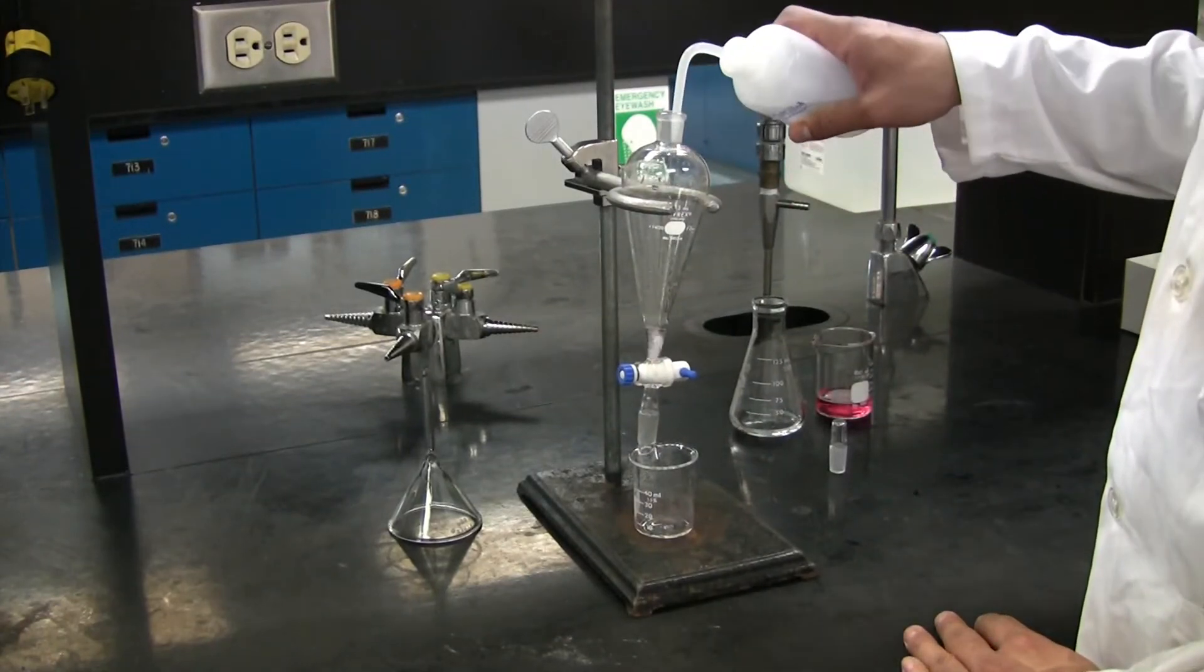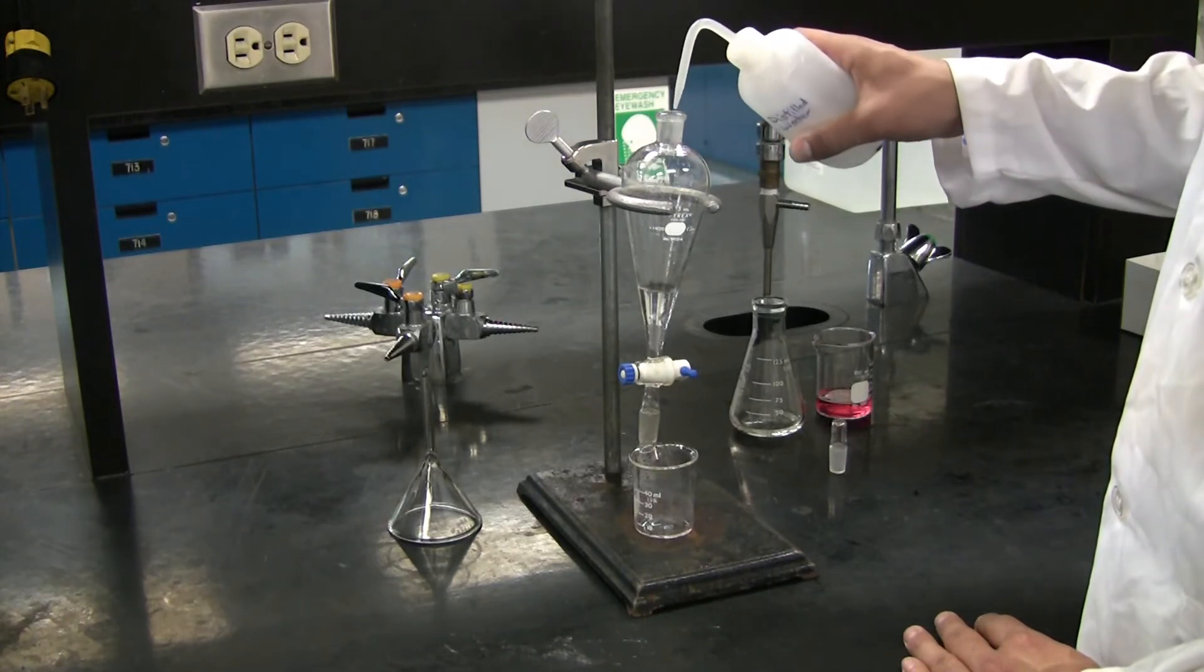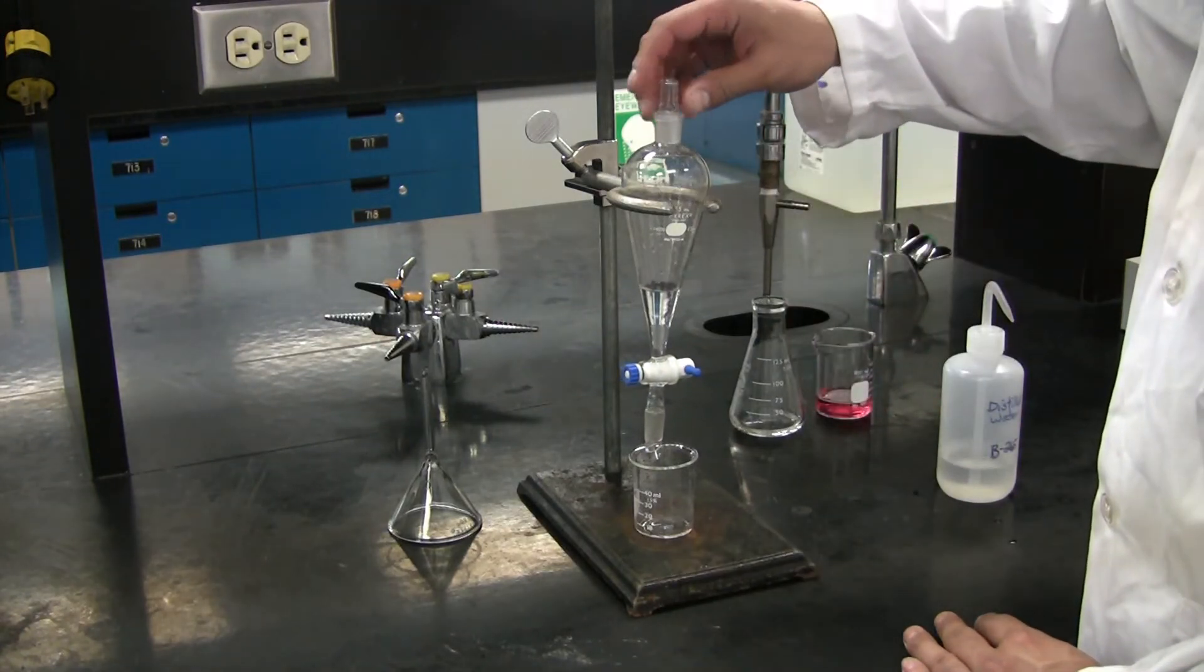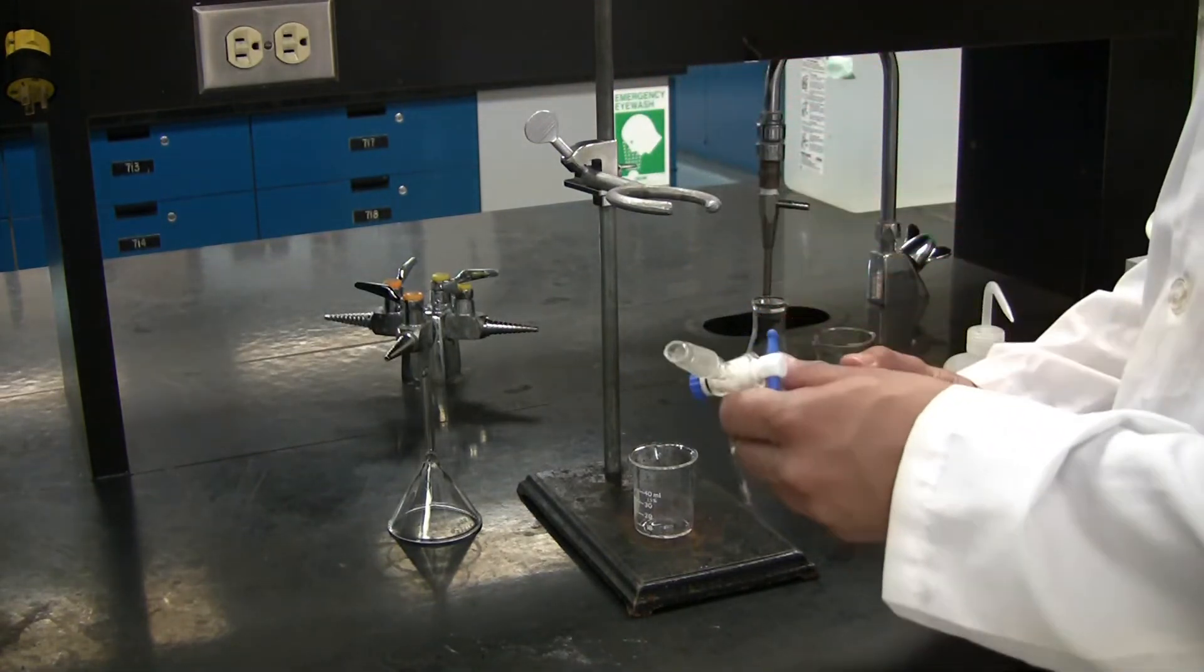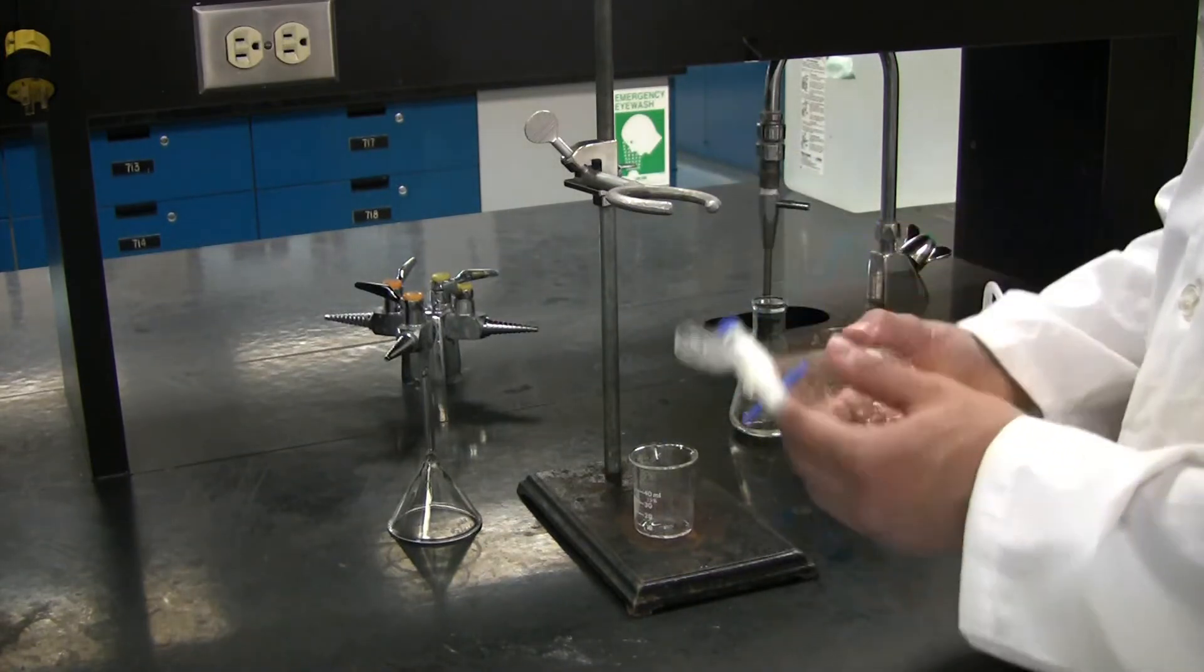Now, you must clean the separatory funnel by rinsing it with distilled water. Place the glass cap back on and remove the separatory funnel from the ring clamp and shake it back and forth to ensure that all of the inside is coated.